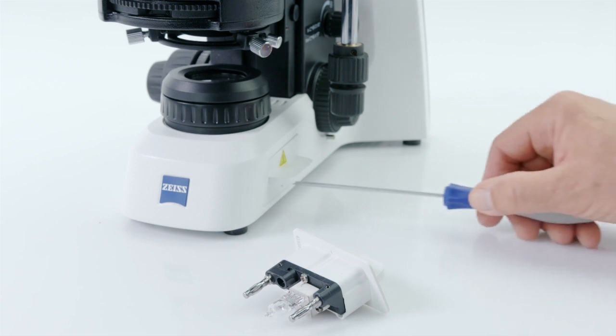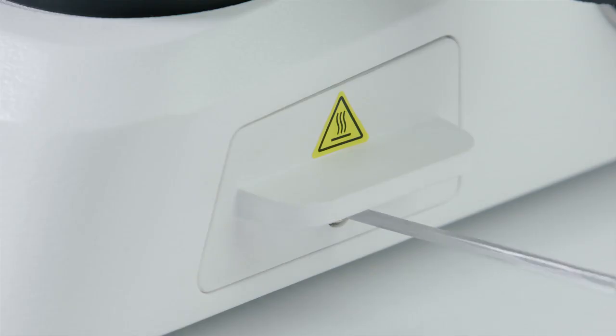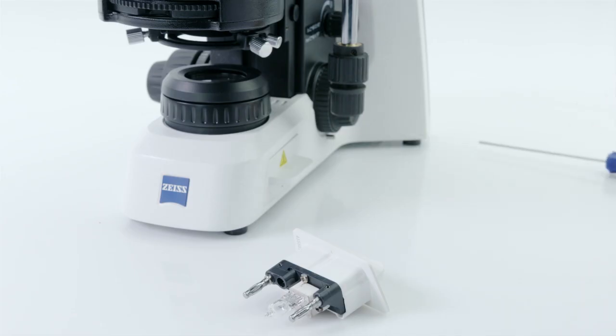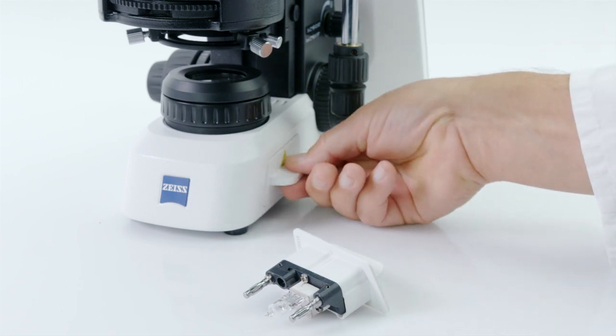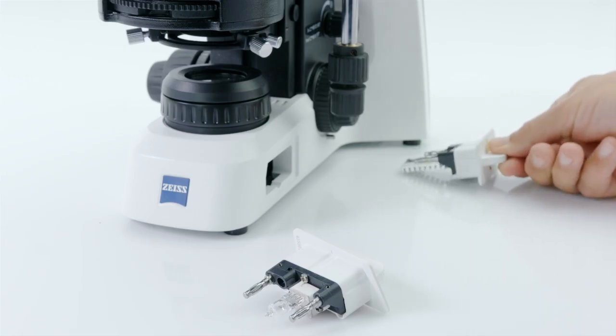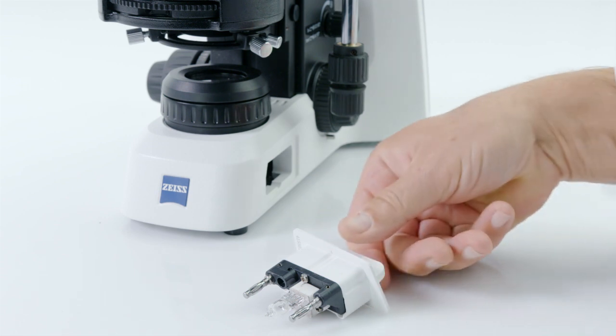All you need is an inbus key screwdriver, and even that comes in the PrimoStar 3 toolkit. Start by using that screwdriver tool to loosen the screw underneath the lamp housing until you can pull the insert out.